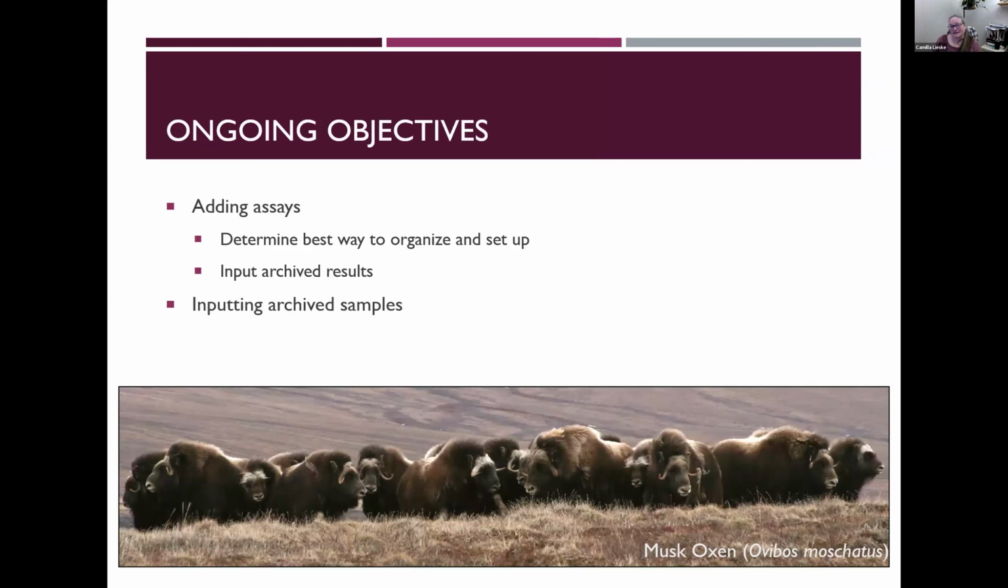We are fairly early in our process. So far, in our decision in transferring from our Access and Excel method of tracking to using Sample Manager, anything that came in starting the beginning of last year has been entered into LabKey, and we're slowly working through our databases of our older archive samples, making sure that there's no errors in what animals they are, making sure that we're not duplicating what we're putting into the database, but we're slowly adding all of those archive samples.